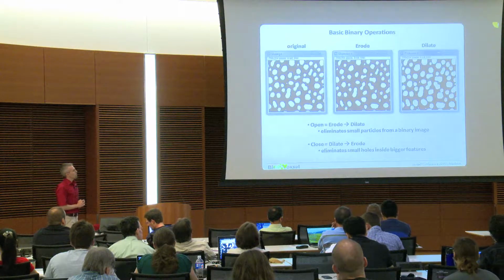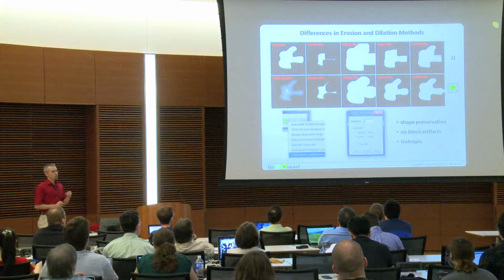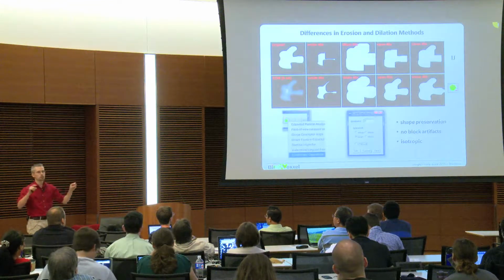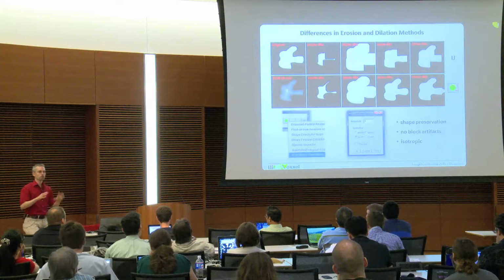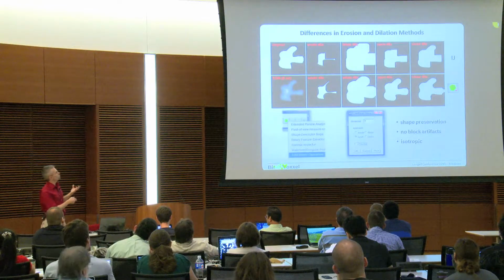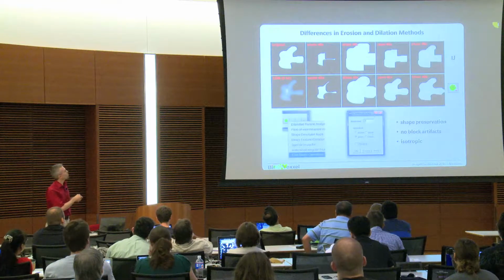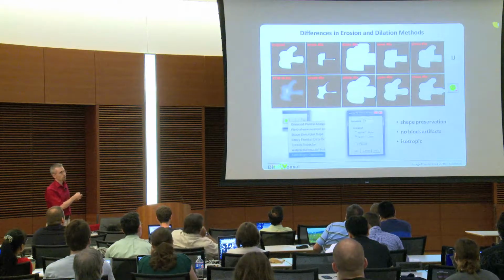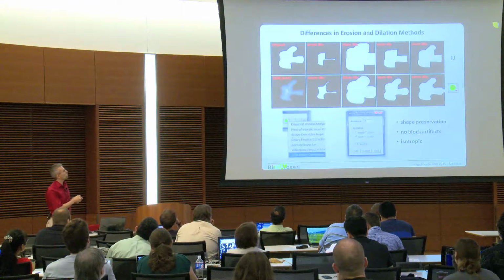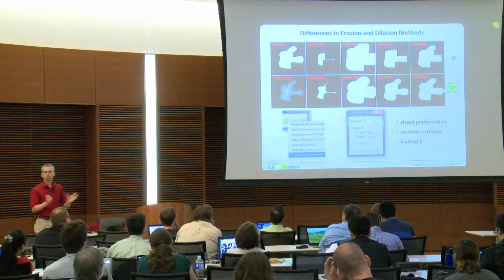First to these ones. If we use the standard function and we need to use it only with one pixel row, it's not a problem. It just takes off one pixel row and everything is fine. But if our processing requires us to use that more often, then you see here, this is my original particle, and if I do that 40 times, either an erosion, a dilation, or an opening closing function, then you get these lines and here you get these blocks. So the original shape is altered.